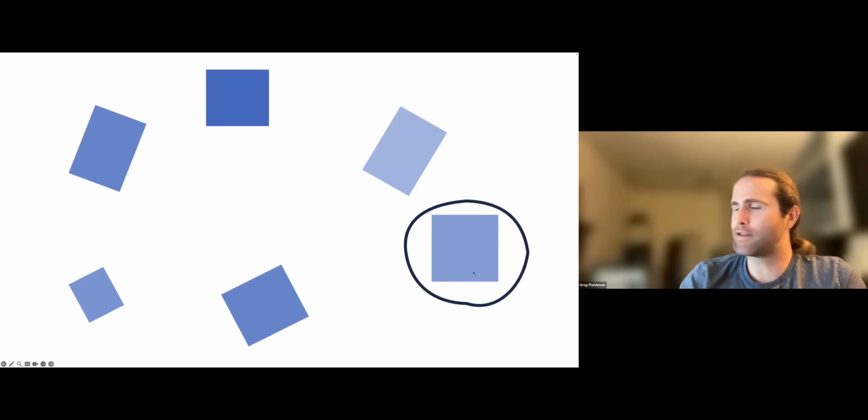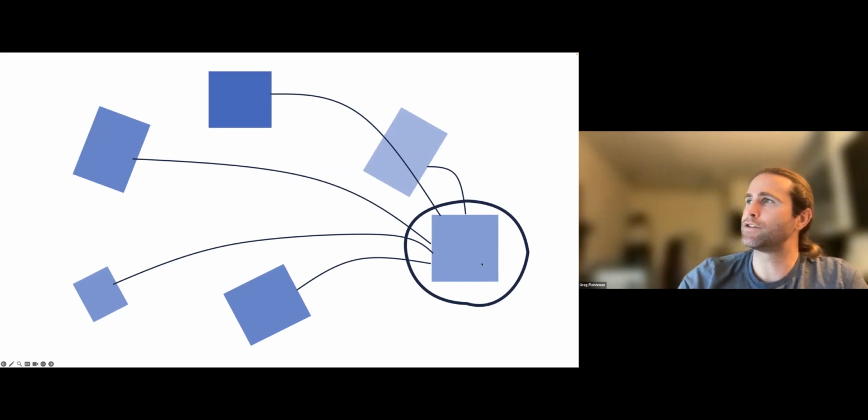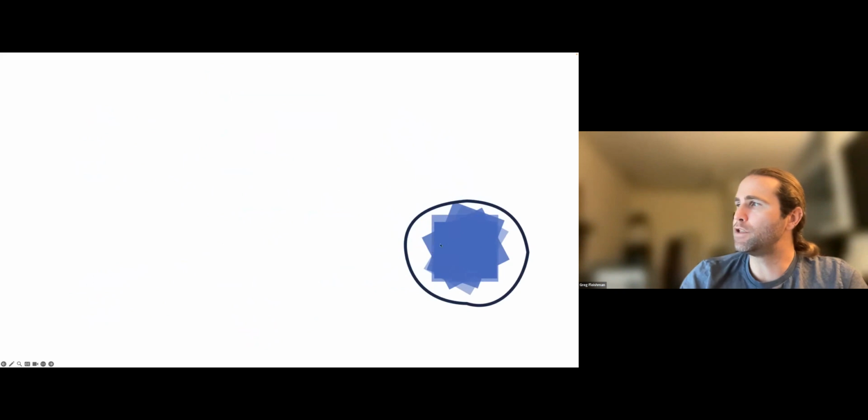You're saying, all right, this subject is going to be representative of the whole data set. Then you register every other subject to that one individual, and then you use those registrations to resample the images from all of the subjects so that now they match that one individual subject as closely as the registration algorithm could accomplish.